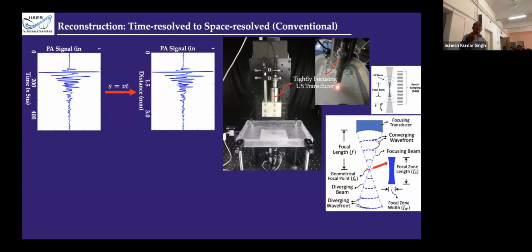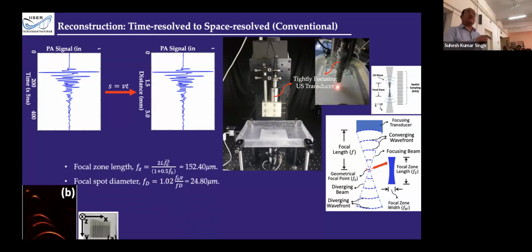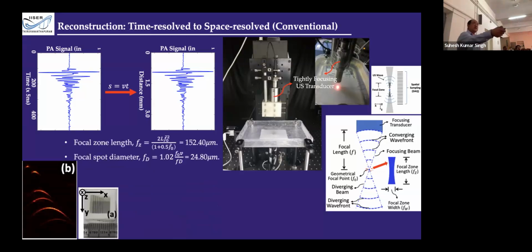We assume that over this focal length, this area is uniform. This obtainable length through which it is uniform, theoretically we can calculate it, is 150 micrometers only. It's very limited. The field of view along the axis is very limited.